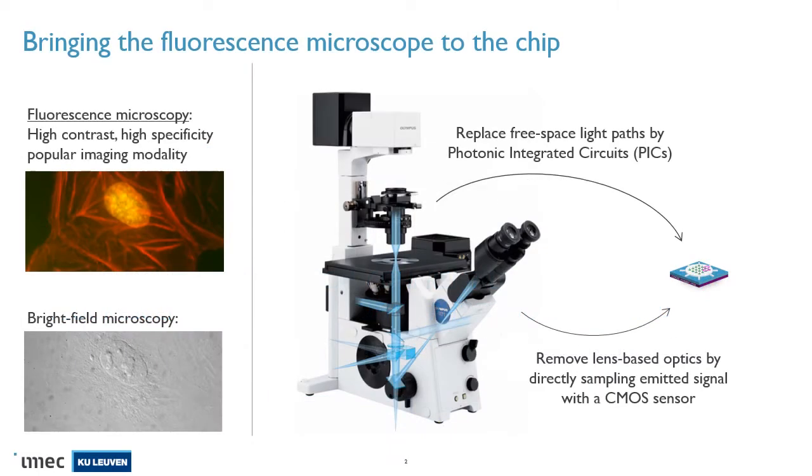The fluorescence microscope itself is arguably one of the most popular tools in the life sciences, and miniaturizing the rather bulky equipment to chip size might set it free from the specialized lab environment and make it available for all. We propose a concept based on integrated photonic circuits, co-integrated on a CMOS camera chip to avoid the complex free space light paths and the rather large multi-element lens-based light collection optics.